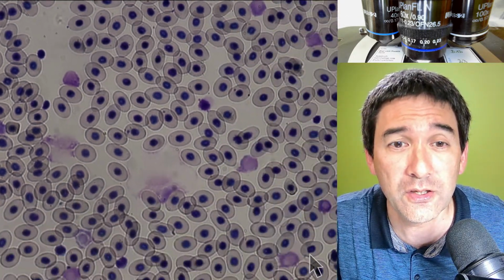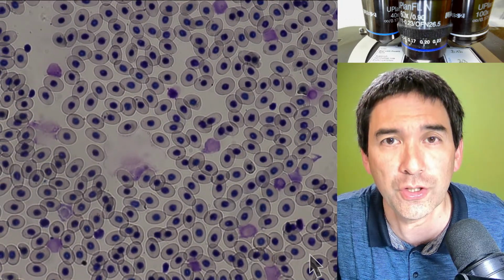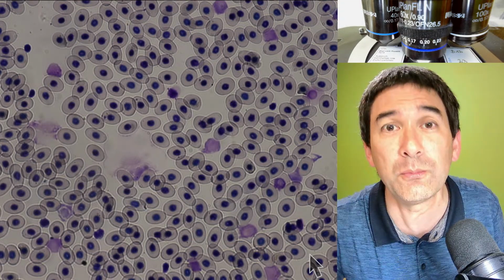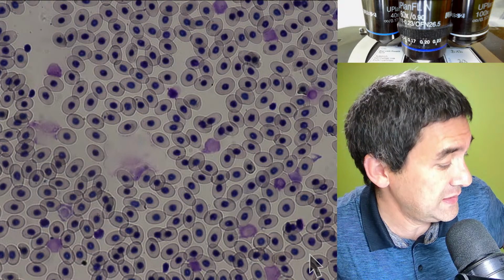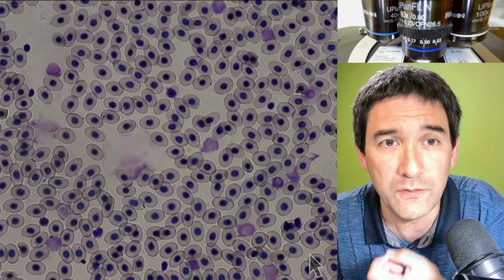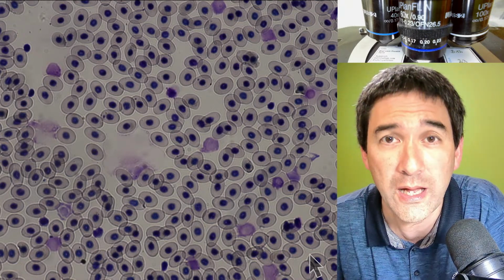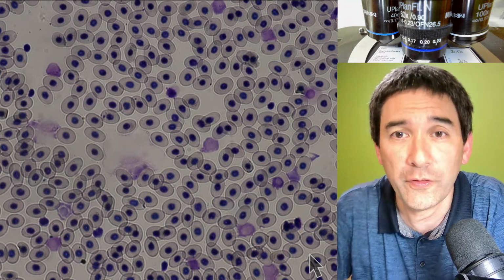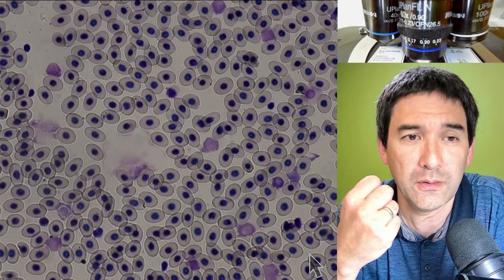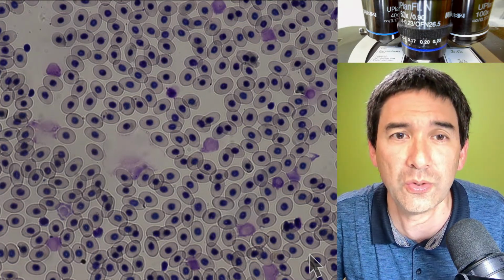So if you want to increase the magnification, there are many ways to do that. I can zoom in a million times if I want to, but I'm not going to see more details. That is something I want to inform you about. If you want to get a good magnification, you have to do it over the objectives, because the objectives are the limiting factor. You can of course zoom in later as much as you want.